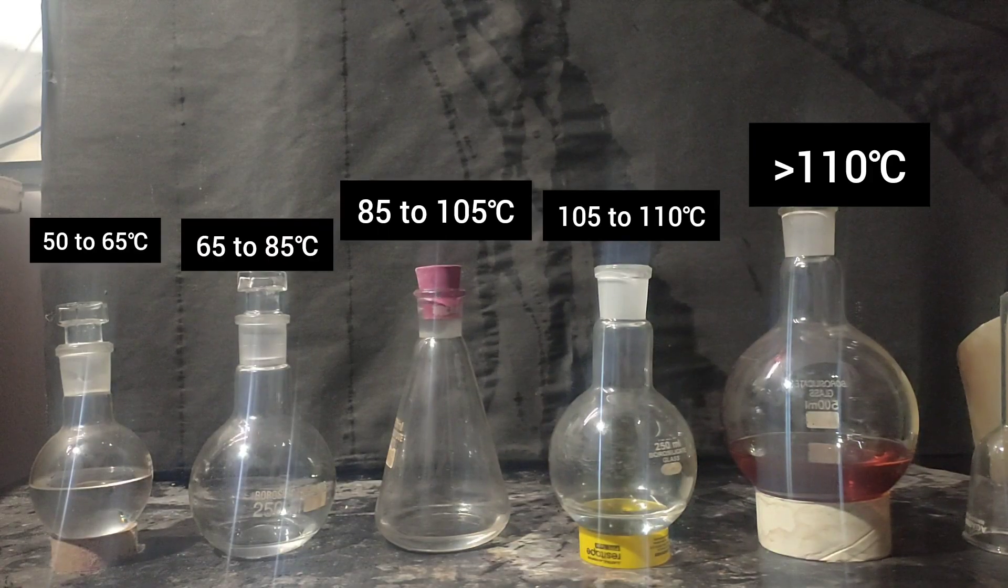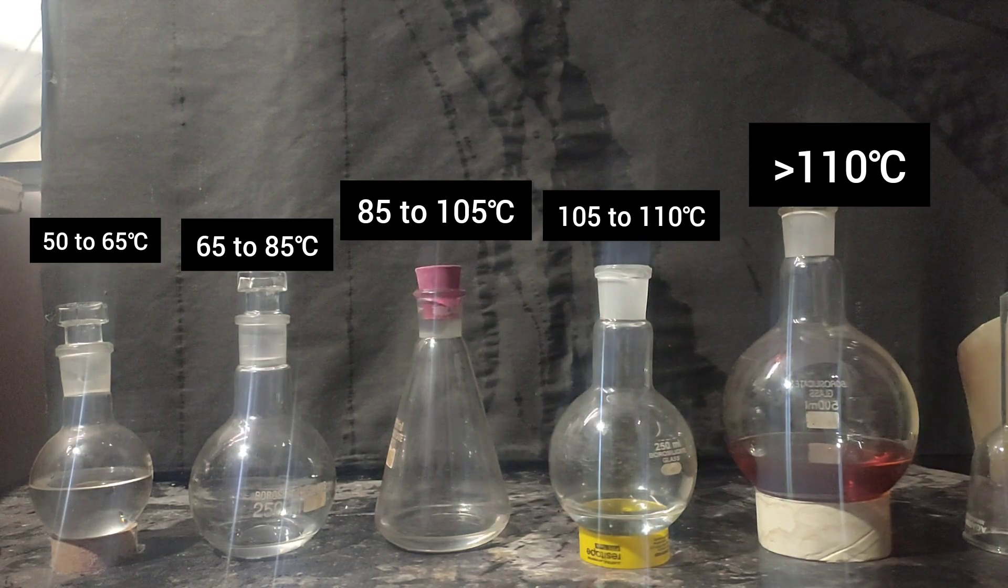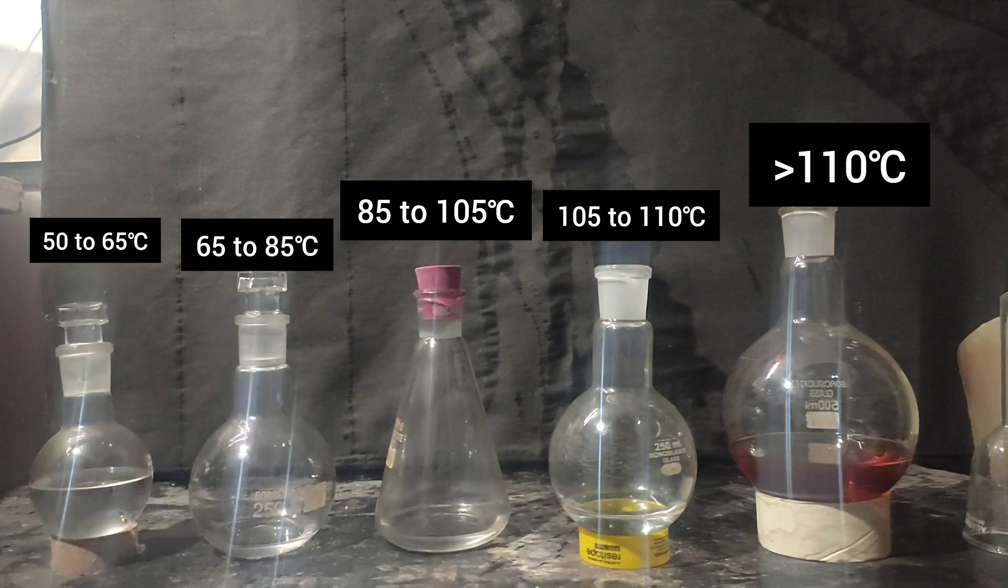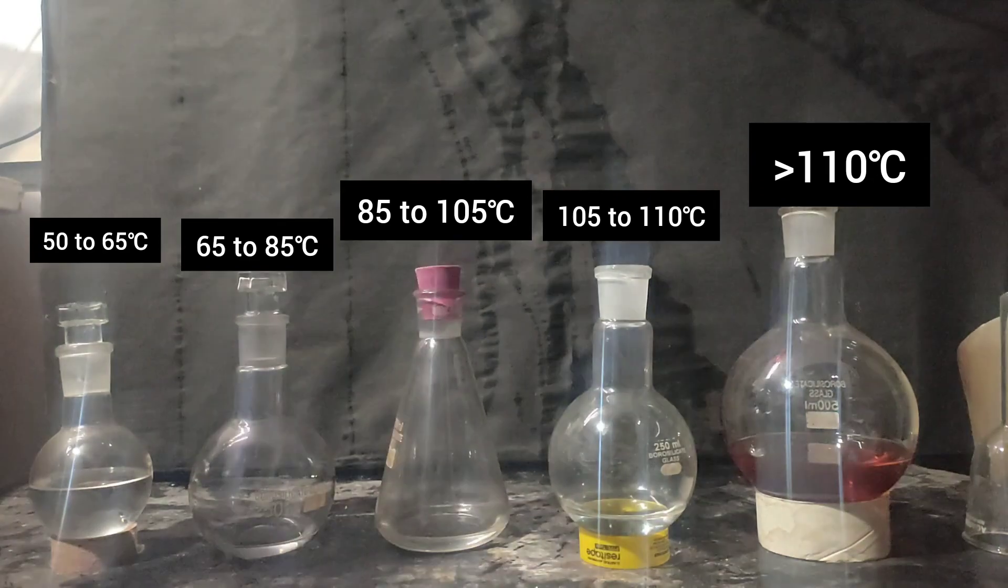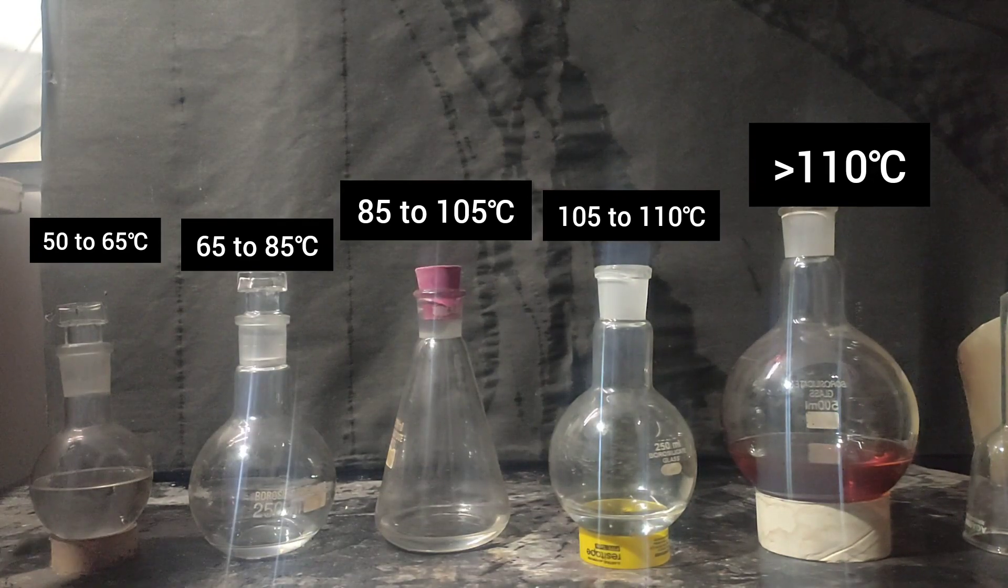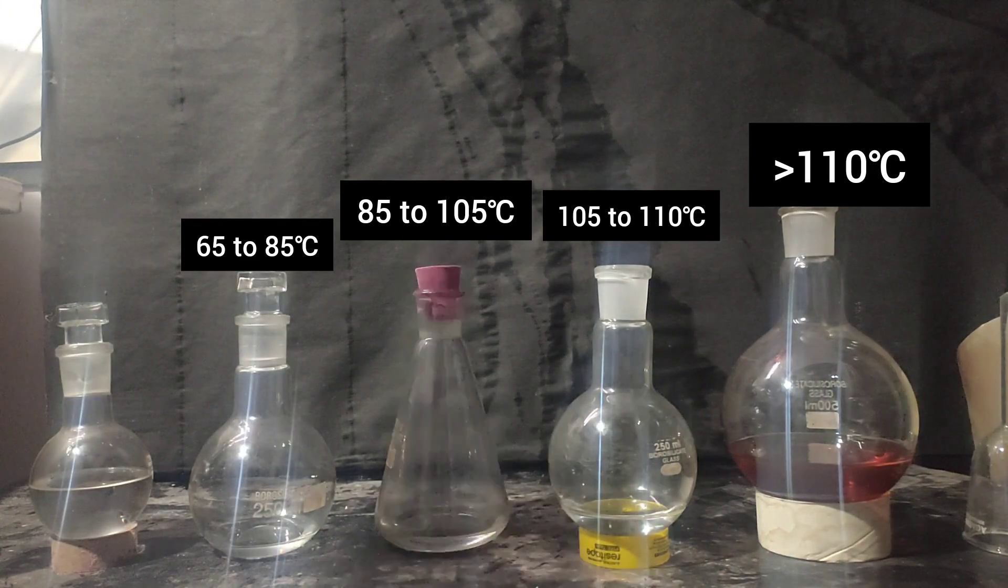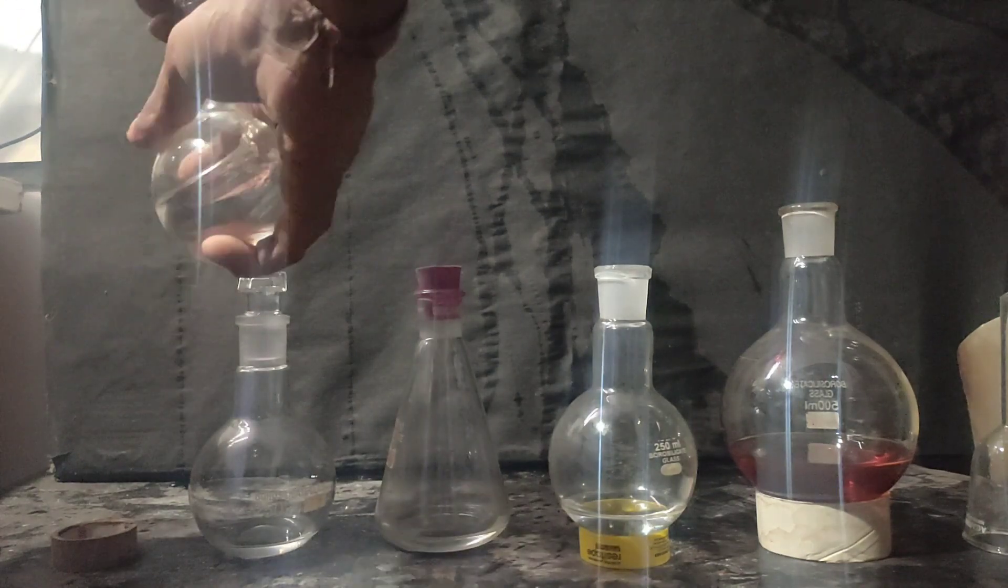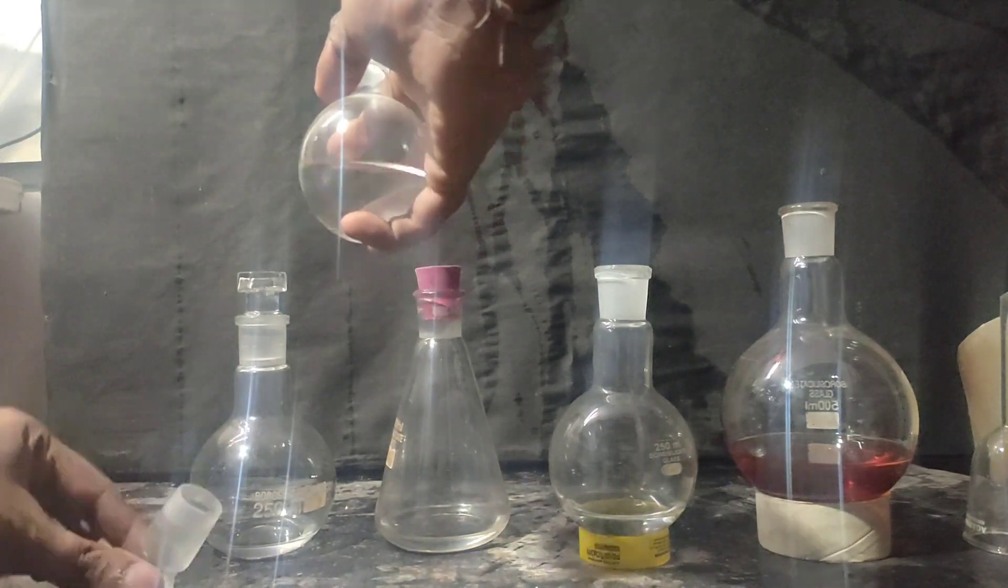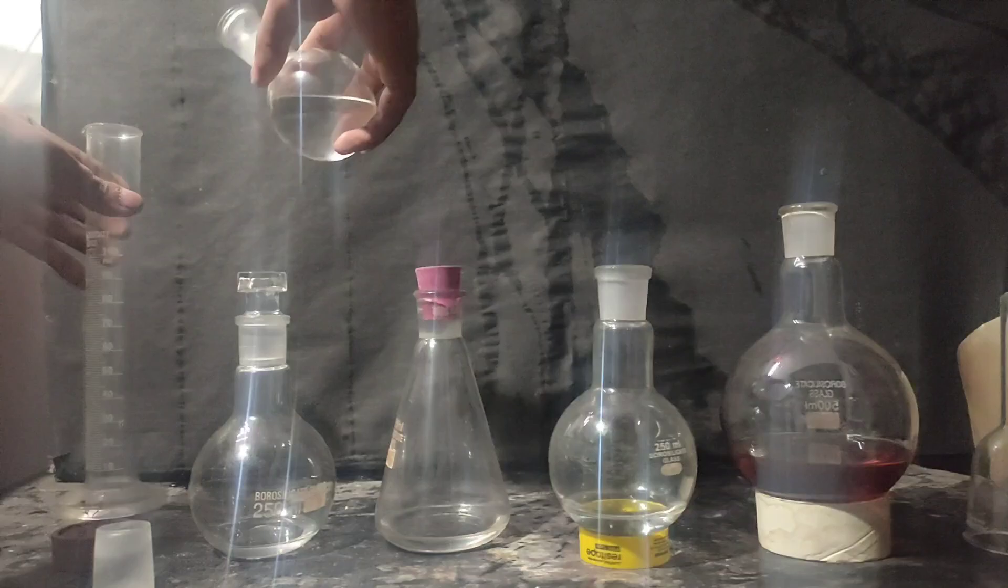These are the fractions that I have collected. On the right, we have the leftover gasoline. The fraction on the left came around between 50 to 65 degree celsius. This can be used as petroleum ether.